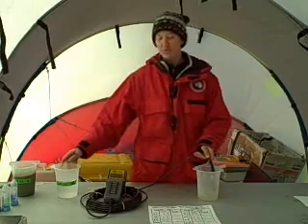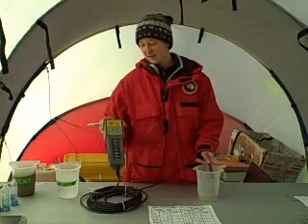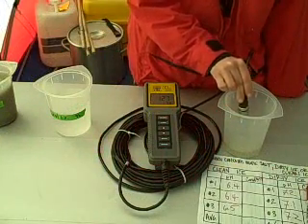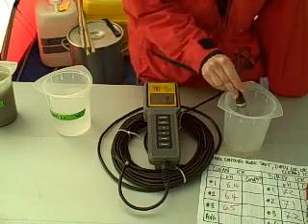For our next set of measurements, we're going to look at the conductivity of our ice samples. So the first one that we're going to do is our clean ice. And we have a new meter now, and it is called the conductivity meter. And we're going to be measuring in microsiemens. So for our first set of conductivity readings, we're going to take the conductivity of the clean ice.